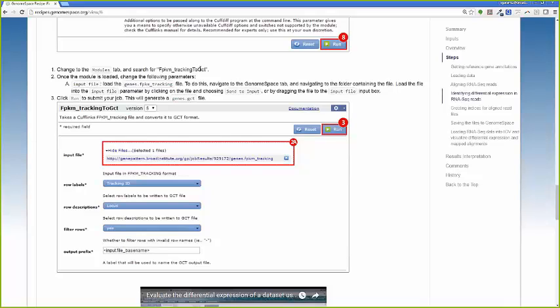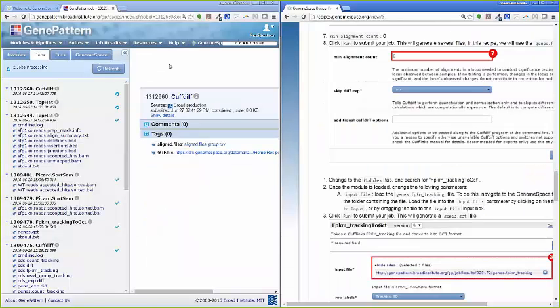It's essentially just an estimate, the RNA-Seq estimated expression for our RNA-Seq data. It's an estimate of gene expression. We need to convert that file to a more readable format, a GCT file, which will display the gene expression values in a matrix where each row is a gene and each column is a sample.